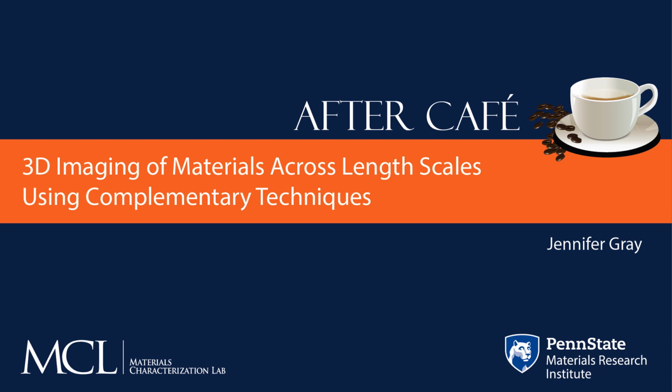So what I'm talking about today is how we can use 3D imaging of materials across different length scales using complementary techniques. So we can look at materials at the macro scale and then correlate that region all the way down to the micro level, even all the way down to the atomic level in some instances.